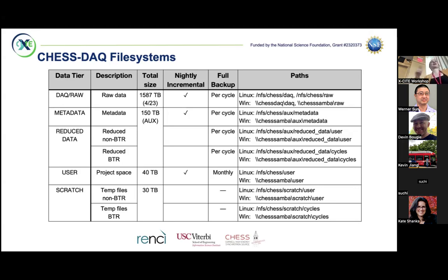And in the training that's actually in the Markdown, it explains all the things I just said to you in words of recommended use of these files. But your Beamline scientists should let you know where they think your particular data set or your workflows should go within this file system scheme. But it's important to know that each data tier actually has a very different use case and has different backup policies and different sizes.